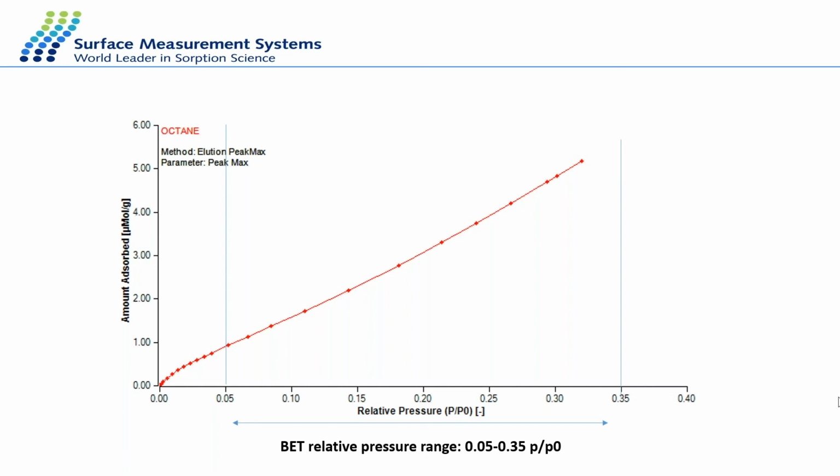Okay, thanks, Anett. There's another question. If I get very bad noisy peaks for ethyl acetate, can I use chloroform to determine the surface energies? And what are the alternative monofunctional solvents that I can use? If the ethyl acetate is very noisy, I recommend using toluene. That might help. And yeah, you can use chloroform. That's for the other part, the base part of the specific surface energy. And also dichloromethane is an alternative.